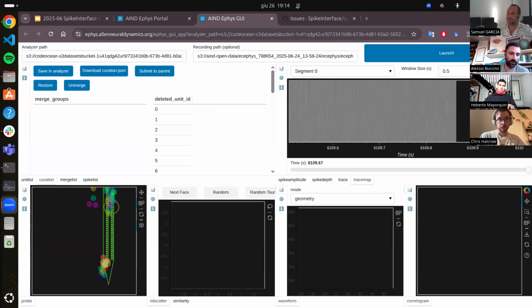Follow up to multi-shank. How about 3D probes? So this is an open issue. We do have support for 3D probes. The problem is that the spike sorters mainly don't. So when you have 3D probes, for example, electrodes on different sides of one shank, the current recommendation would be to set different groups for these, because the probe itself is an insulator.